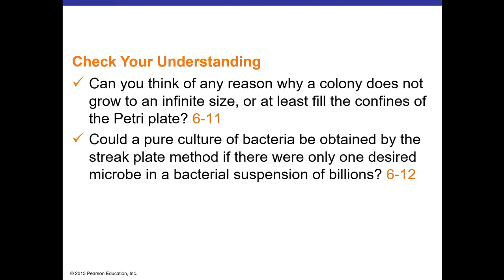So that's why doing a good streak plate is very important. It's a technique that takes time and practice. Unfortunately, we're just going to be doing it in the Labster this time, but it's still going to give you a feel for what the technique is about.